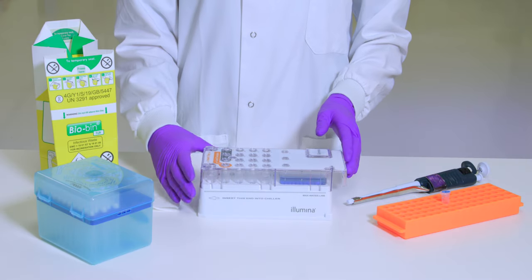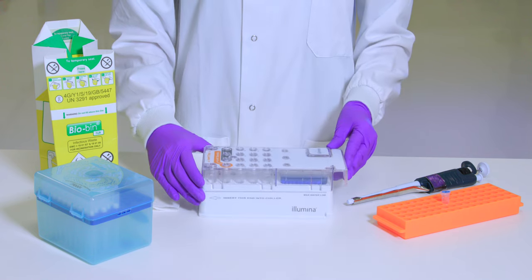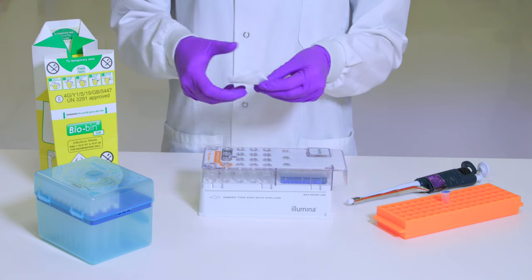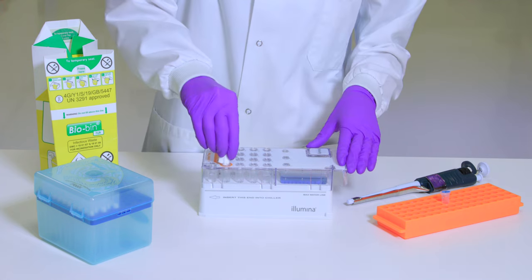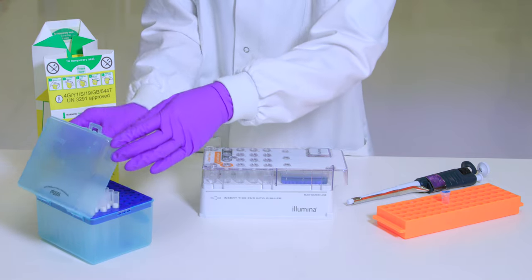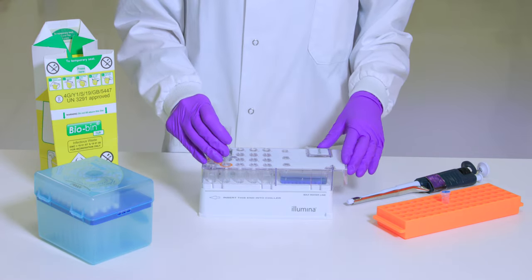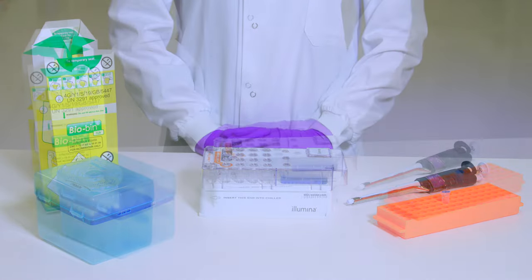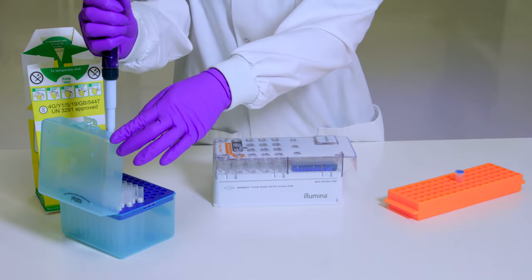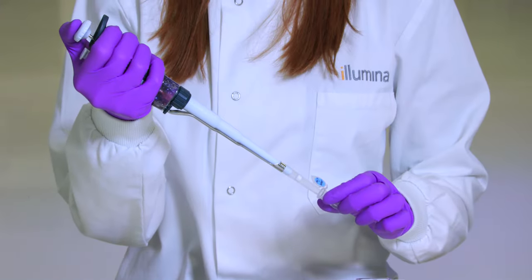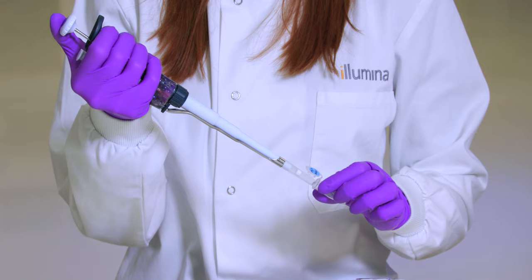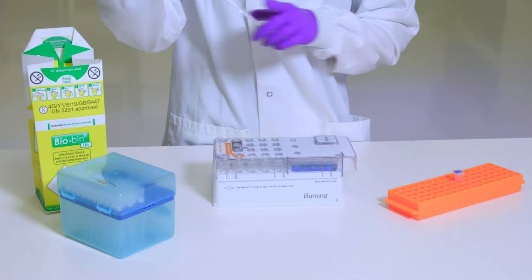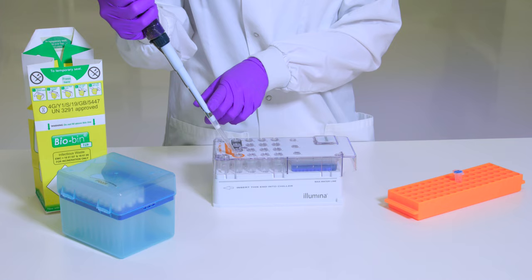When the reagent cartridge is fully thawed and ready for use, clean the foil seal covering the reservoir labeled load samples with a low lint lab tissue. Pierce the foil seal with a clean 1 milliliter pipette tip. Pipette 600 microliters of prepared samples into the reservoir labeled load samples. Avoid touching the foil seal.